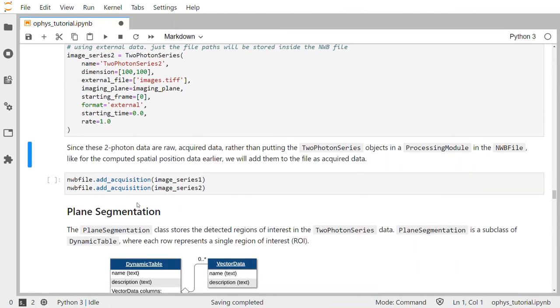Since these two-photon data are raw acquired data, rather than putting them in a processing module like the computed spatial position data, we will add them to the file as acquired data using the add_acquisition method on nwbfile.